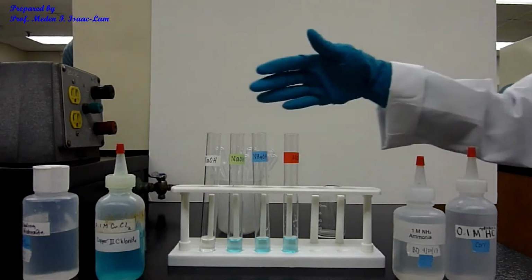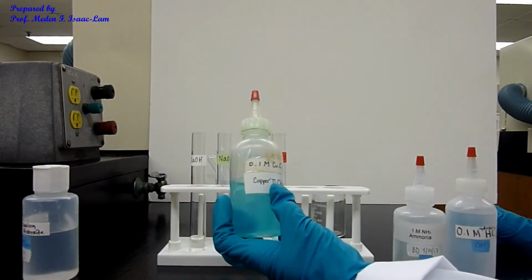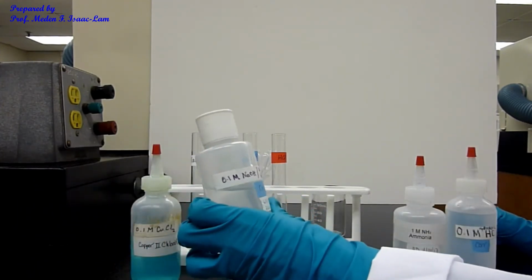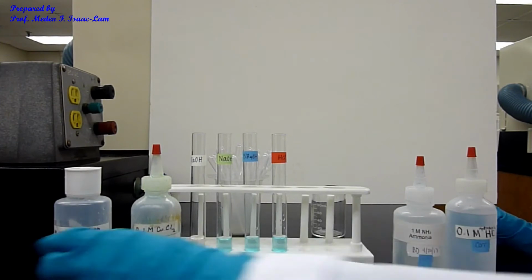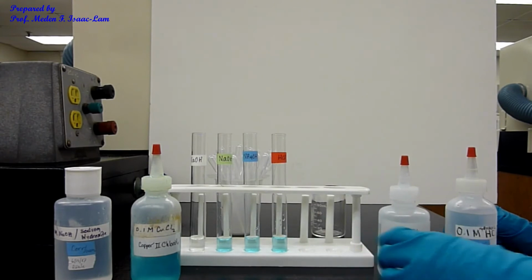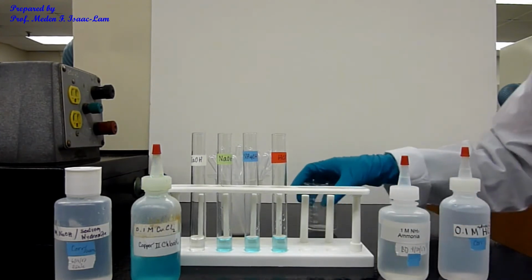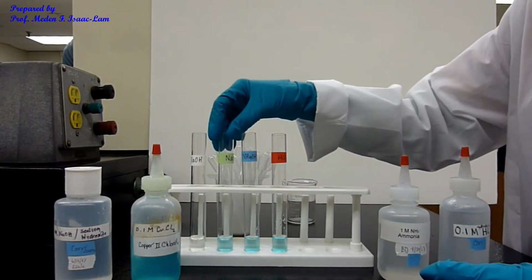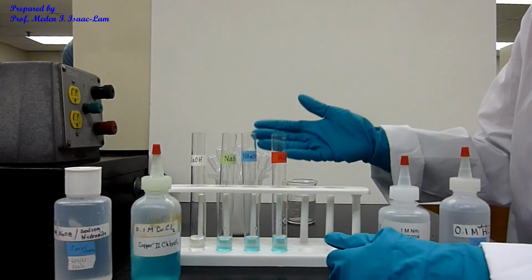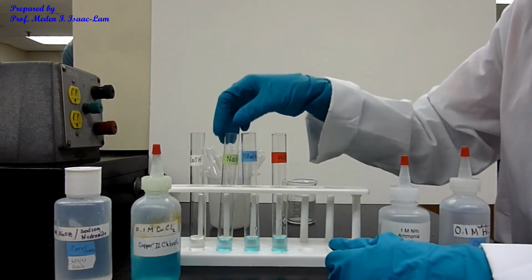So I now have here the tubes. So I have here copper 2 chloride. So it's blue. And then I also have the sodium hydroxide, 0.1 molar. And then I also have ammonia or ammonium hydroxide in water. And then I also have hydrochloric acid. So on the first tube, I have just copper chloride, tube 1, 2, 3. It's all copper chloride, 3 mL. I'm now going to add equal amount of sodium hydroxide in the first tube.